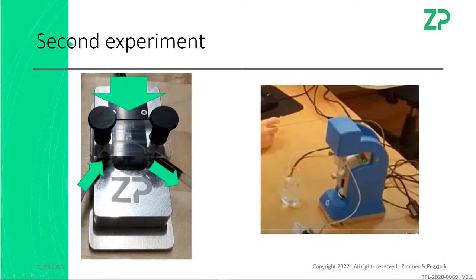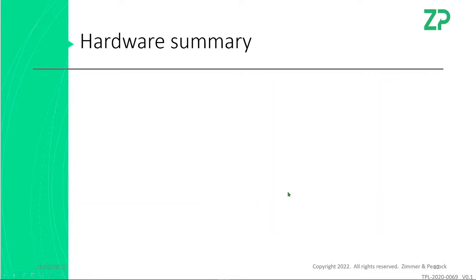If I was to do this type of work myself, I'd use a syringe pump. This is a syringe pump. I'll link to it in a bit. This one has a valve on it, so you can essentially change the inputs. But if you're going to do a flow microfluidic system, then you probably need a syringe pump.